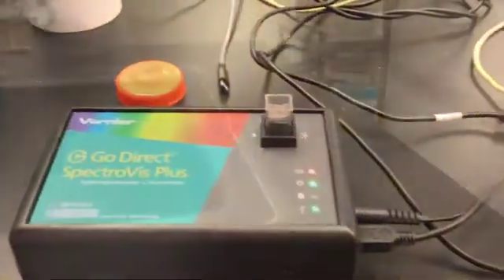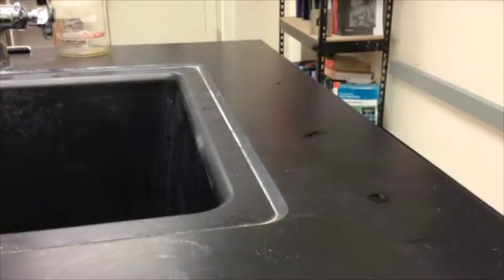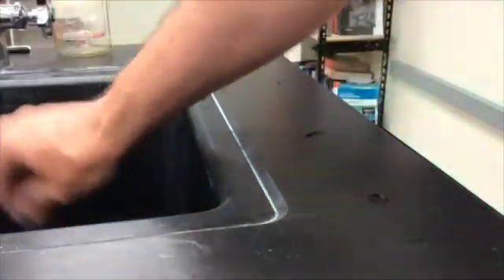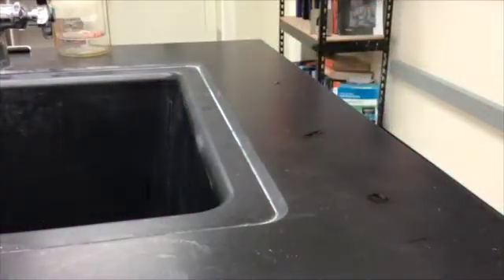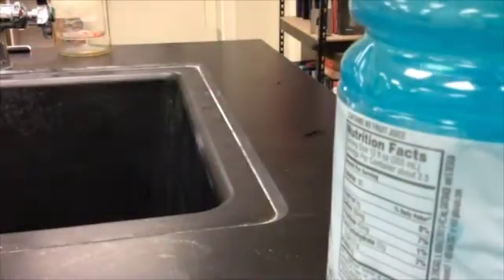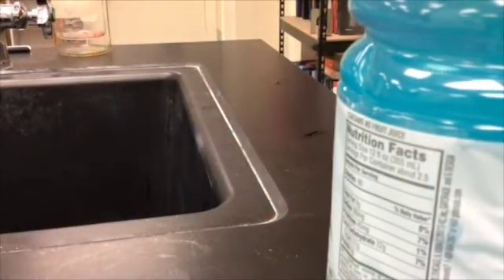We are in good shape to go. And I'm going to take the blank cuvette that I just did, and I'm going to empty it out. Theoretically, technically you're supposed to use the exact same device each time because of small variations in things. Now there might actually still be some water in here.